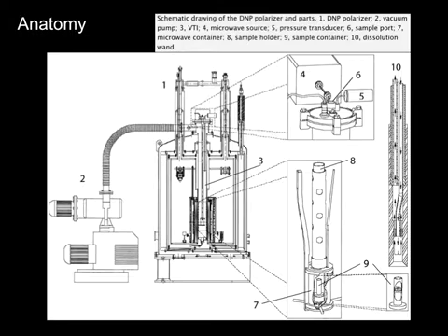Okay, so let's get into a little bit of detail on the hardware here. This is a figure from the first paper by Jan Henrik et al. And it shows how this is really a modified NMR.